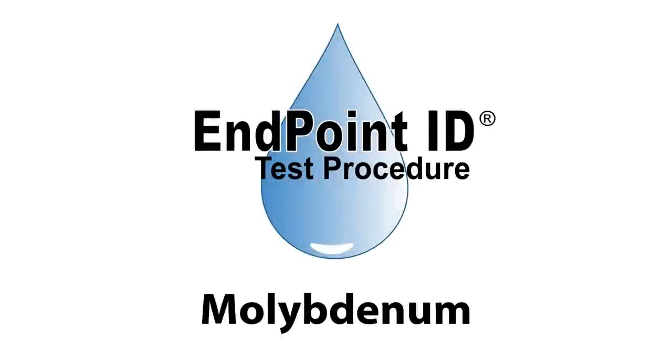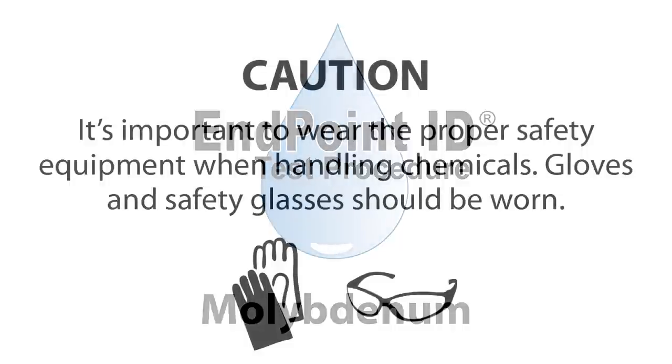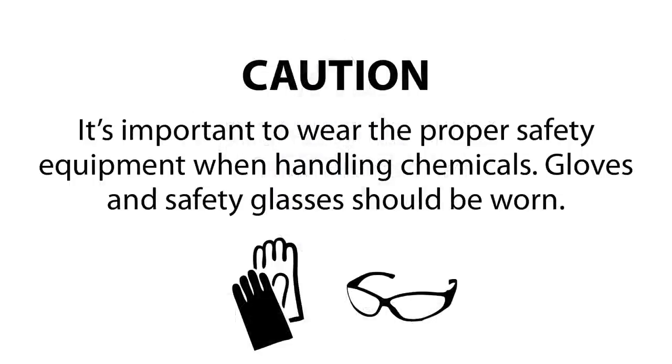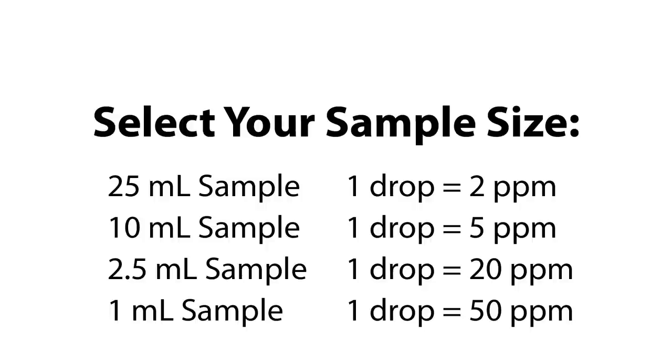This is a demonstration of a molybdenum drop count test kit using endpoint ID procedures. The first step according to the endpoint ID procedure is to select the appropriate sample size. You want to select a sample size that matches the equivalency you would like to use.